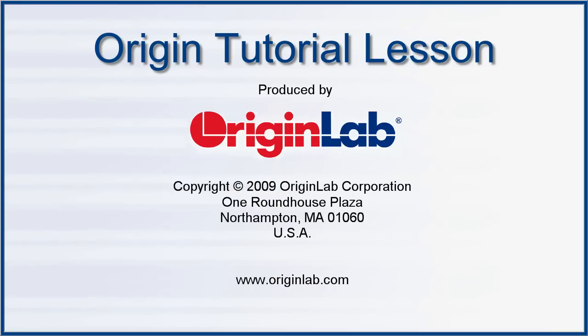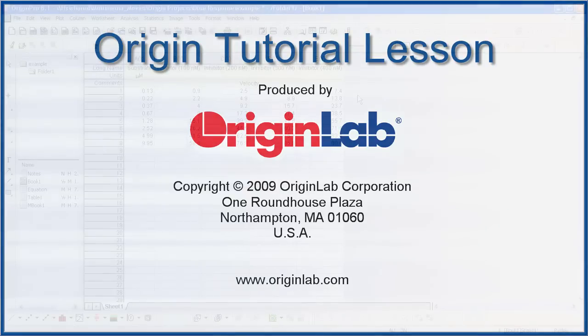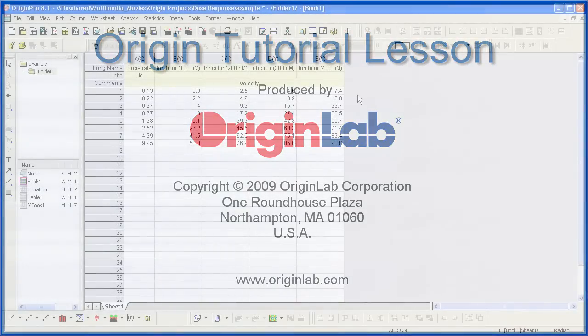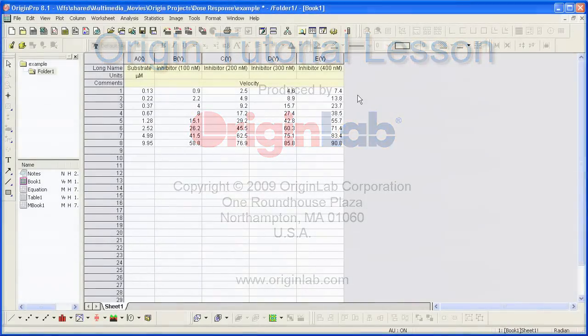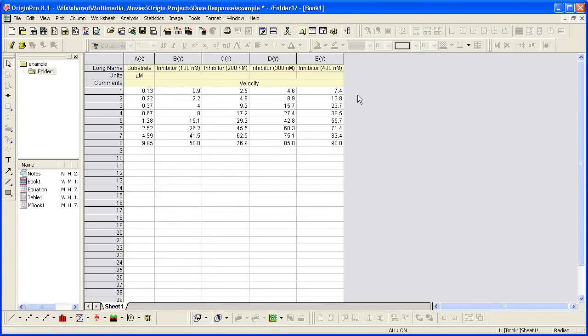In this tutorial, I will show you how to perform global fitting with the dose-response function. Dose-response analysis is used to compare critical parameter values between different compounds, such as the EC50 or IC50 parameter.